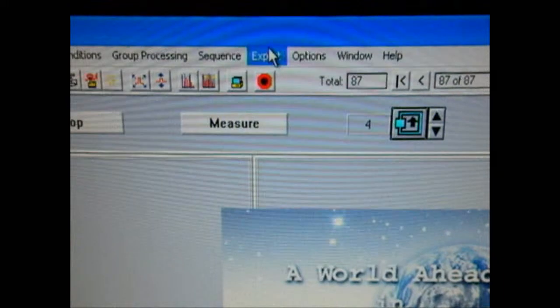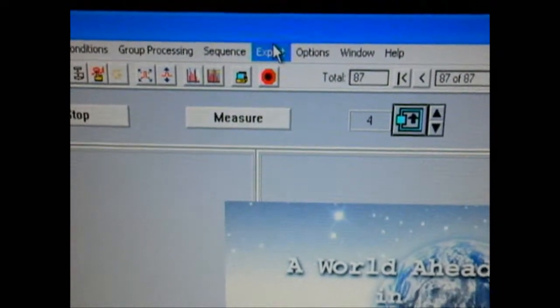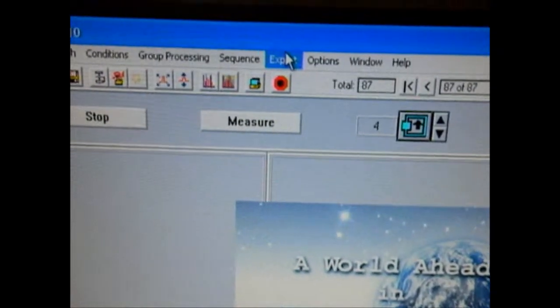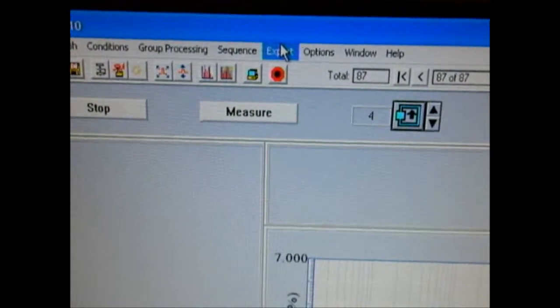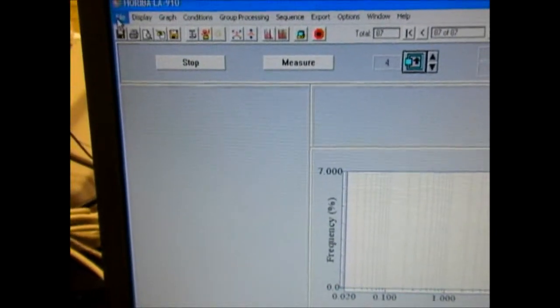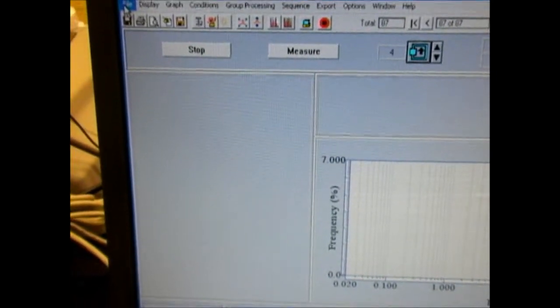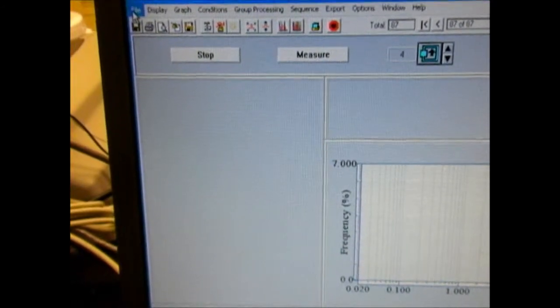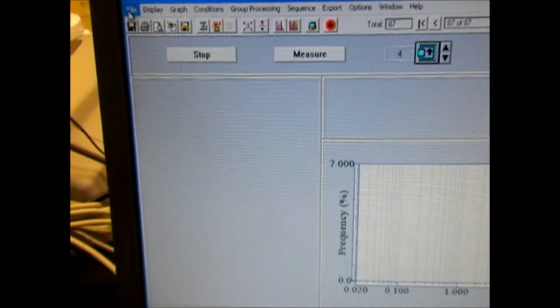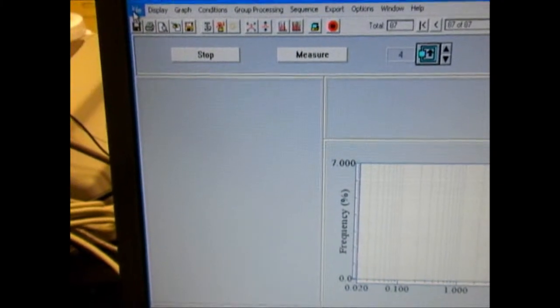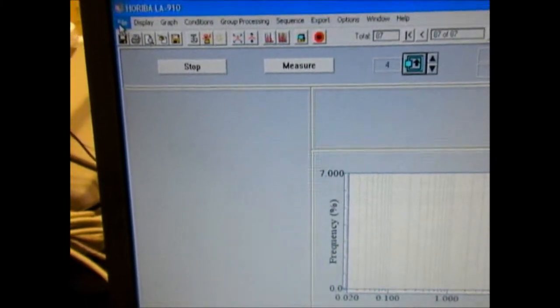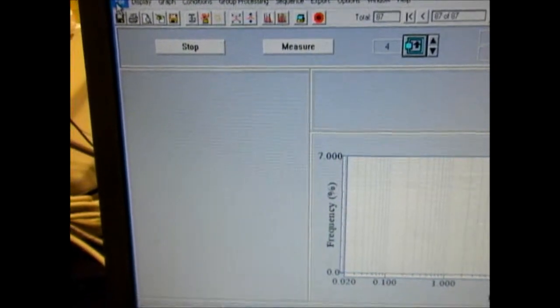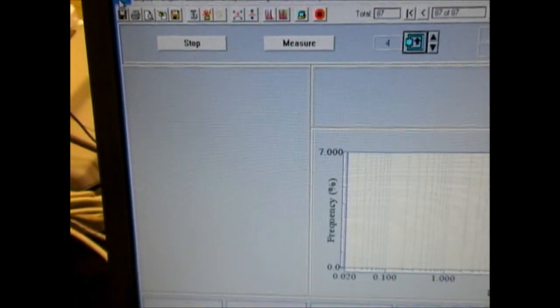Within a few seconds this screen should show up. This is the software which controls the Hariba LA-910. Today we are going to show how to load a particular condition file, verify that the parameters are correct, input information on the sample name and ID, set the test up, do the test, and then get the results printed to a printer.